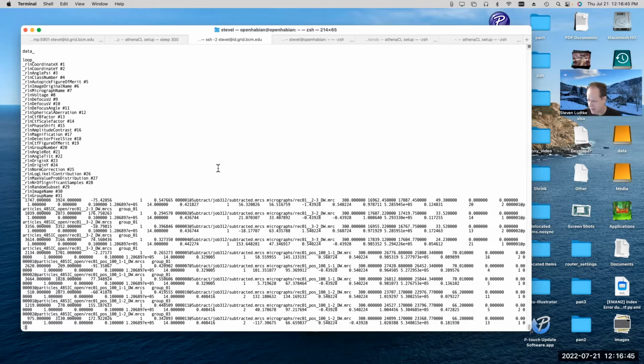So the metadata then gets stored in some other associated file, which will also usually group together the data from many, many different micrographs. If you have all the particles from one micrograph, or maybe multiple micrographs stacked together into a big MRCS file, then the metadata would be stored in one of these companion files. Now, if you're using Relion, the star file format is what's used for this representation.